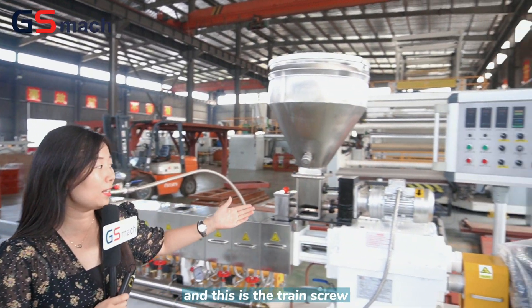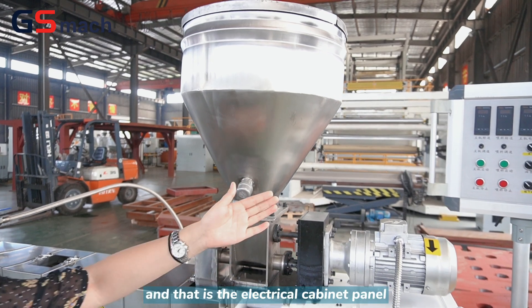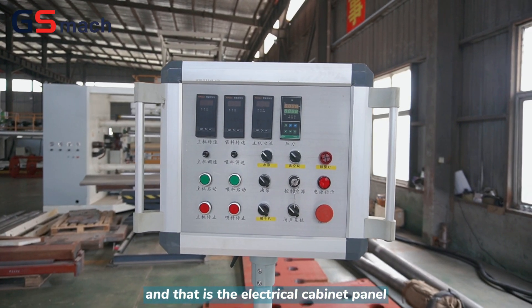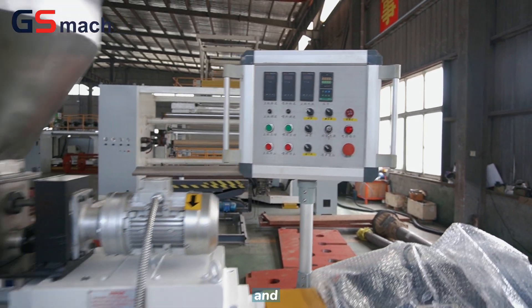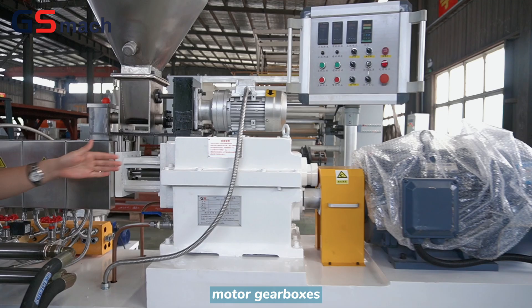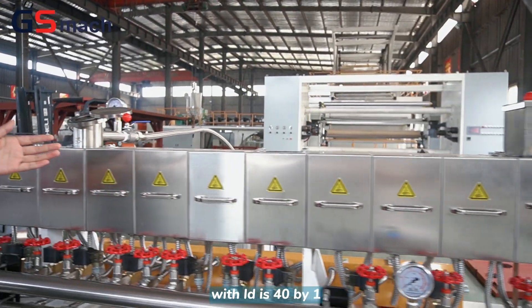This is the twin screw metering unit, and that is the electrical cabinet panel — easy to operate. The motor gearbox ratio is 40 by 1.